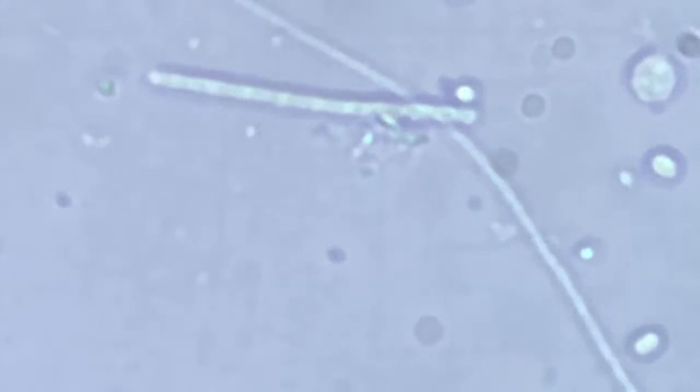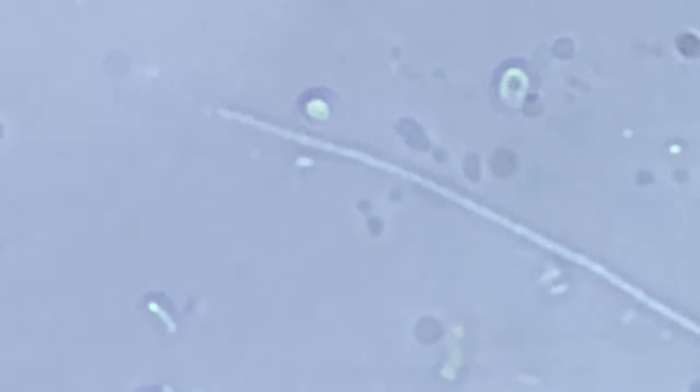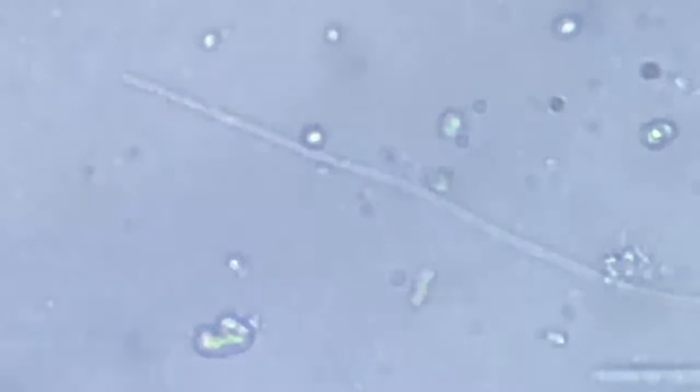So these definitely are worms, but they're not threadworms because they're far, far thicker than a threadworm. They are not whipworms. They don't seem to have any spine on them or any attachment specialization, any organelle that would help them attach to some host, like hooks or something similar. They don't have anything of that sort.